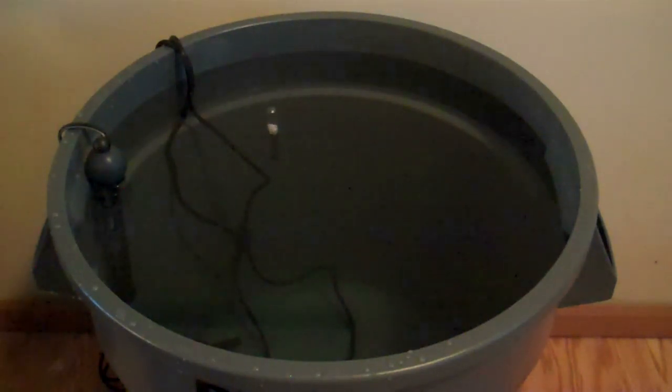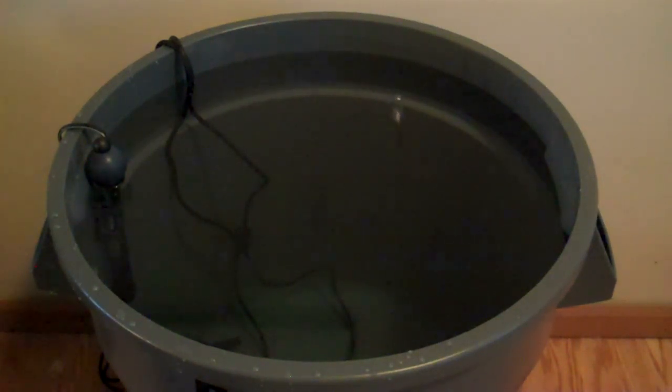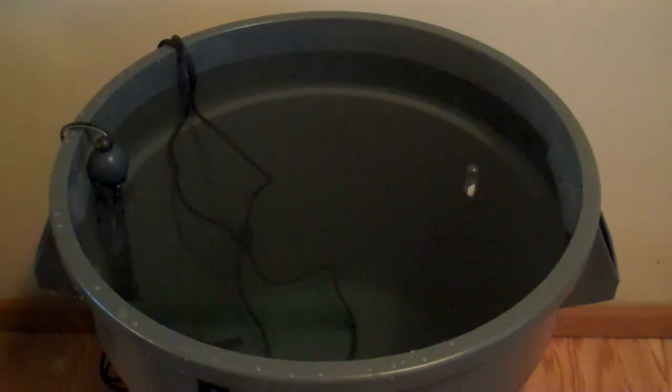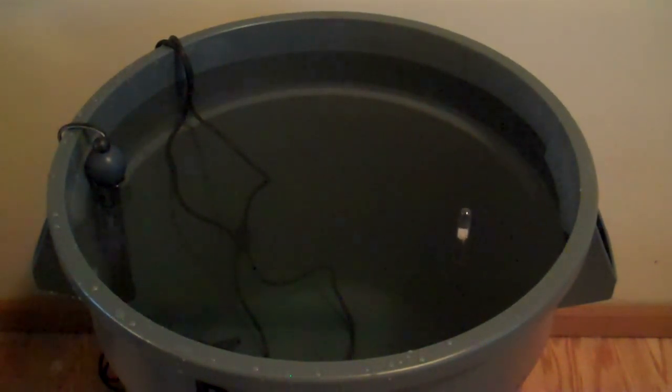I have my water here. It's been a couple of days. I made this water Sunday, and it is now Tuesday.